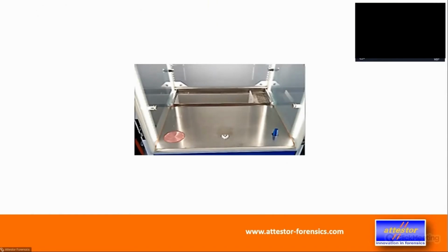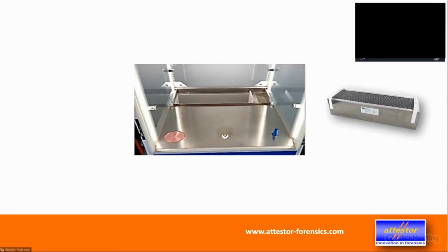So again, this is the view of the system when we have emptied out everything. In the back, you see actually a kind of slot where we put the filter in the end. The filter cassette is typically a fully encapsulated cassette with a dust filter inside, so it doesn't blow out activated carbon into your chamber. There is a second option, which I show you in the next couple of slides. There is a bit more detailed picture. For the moment, I just talk about this full cassette.